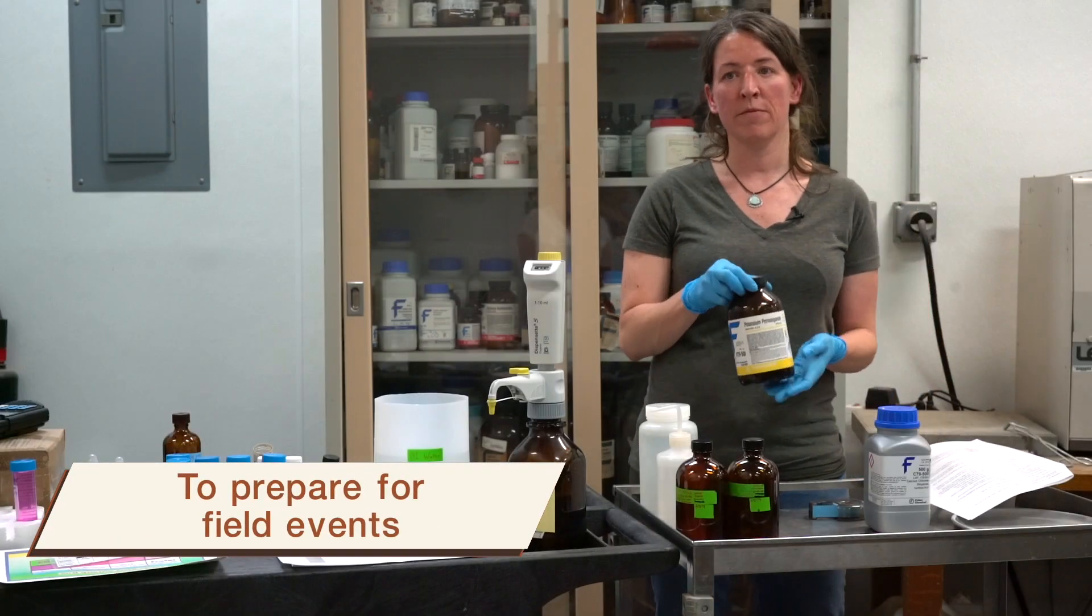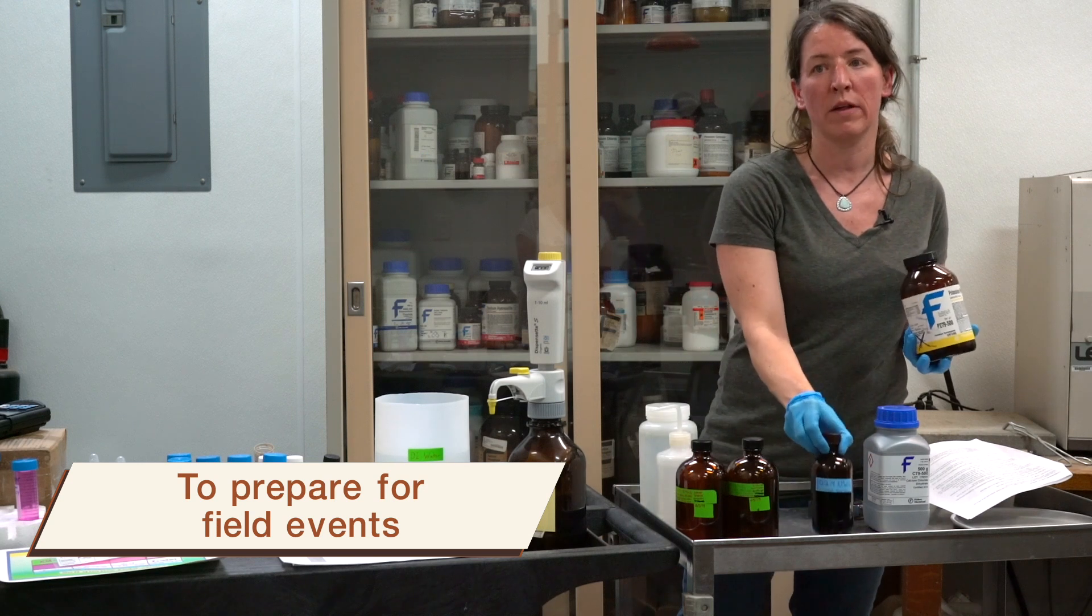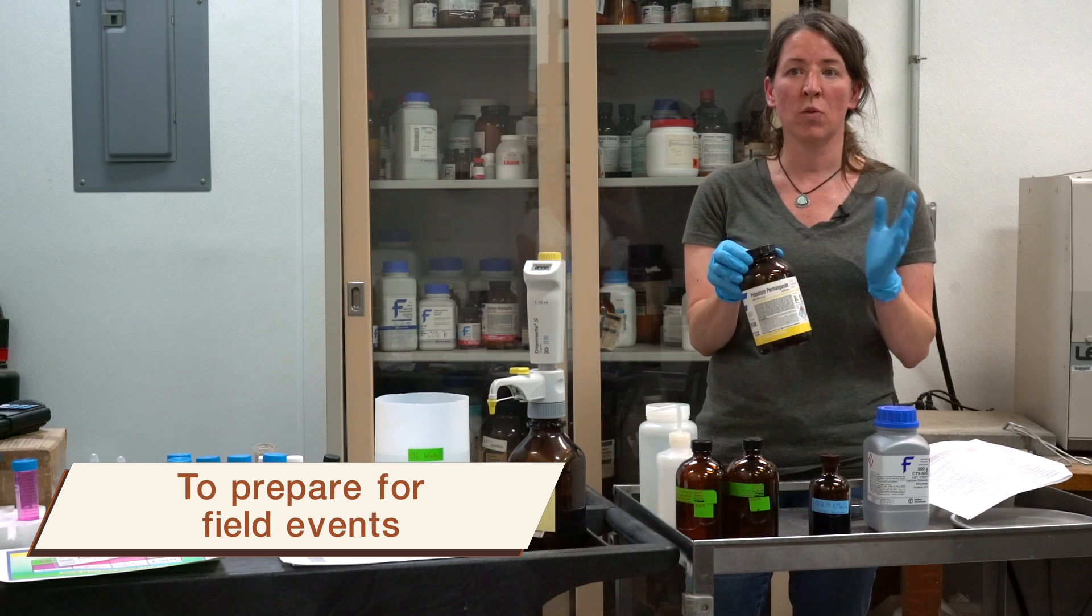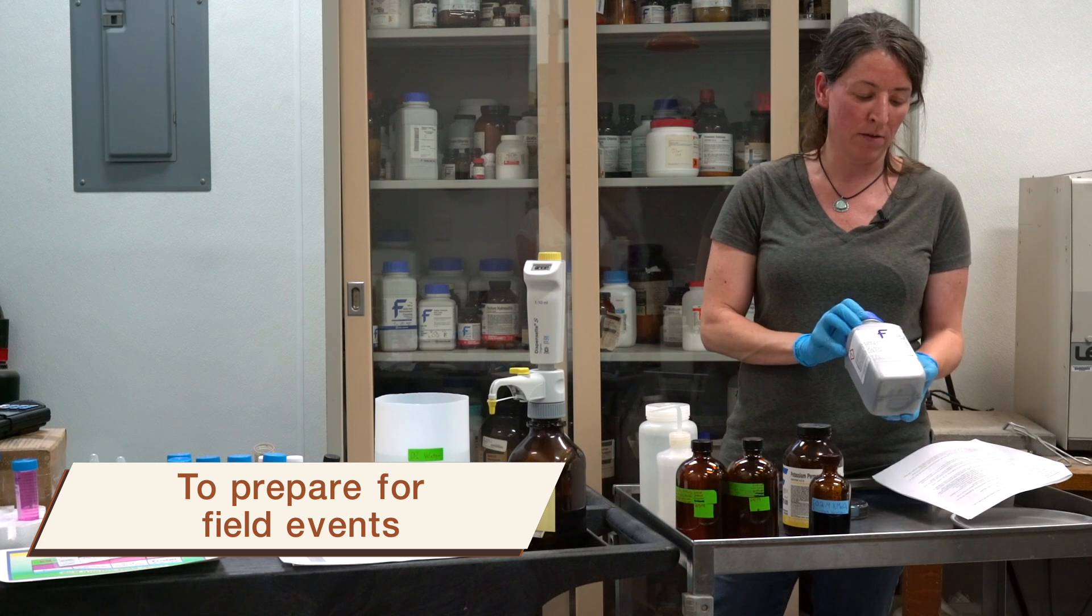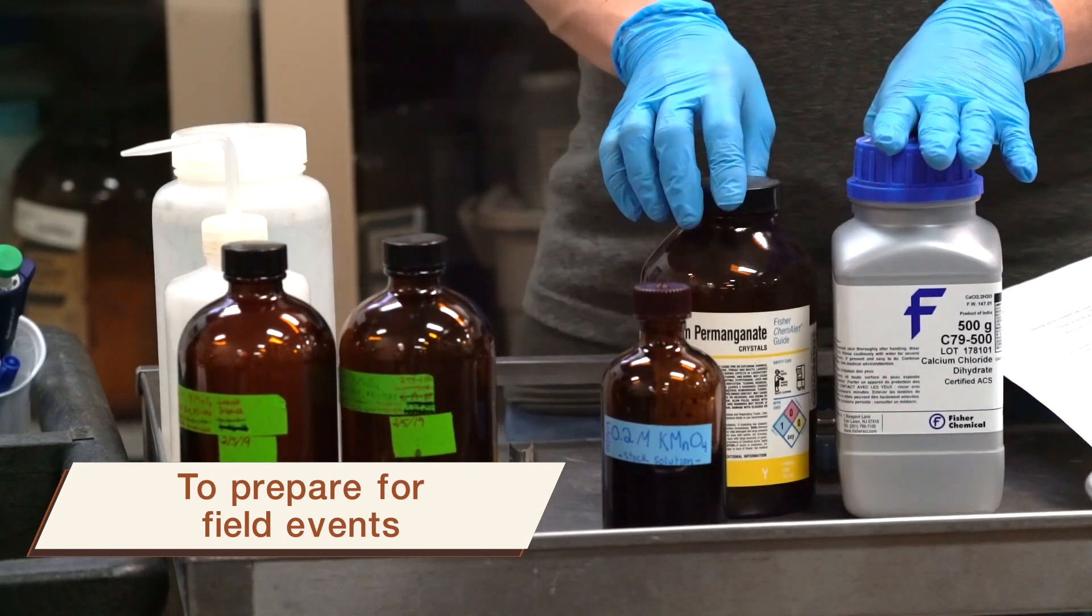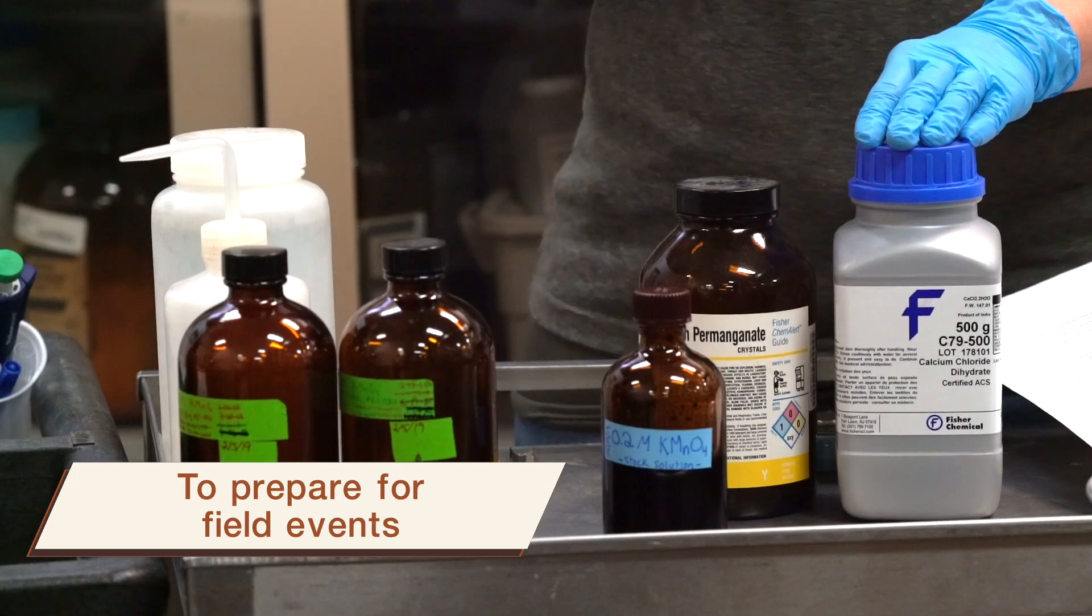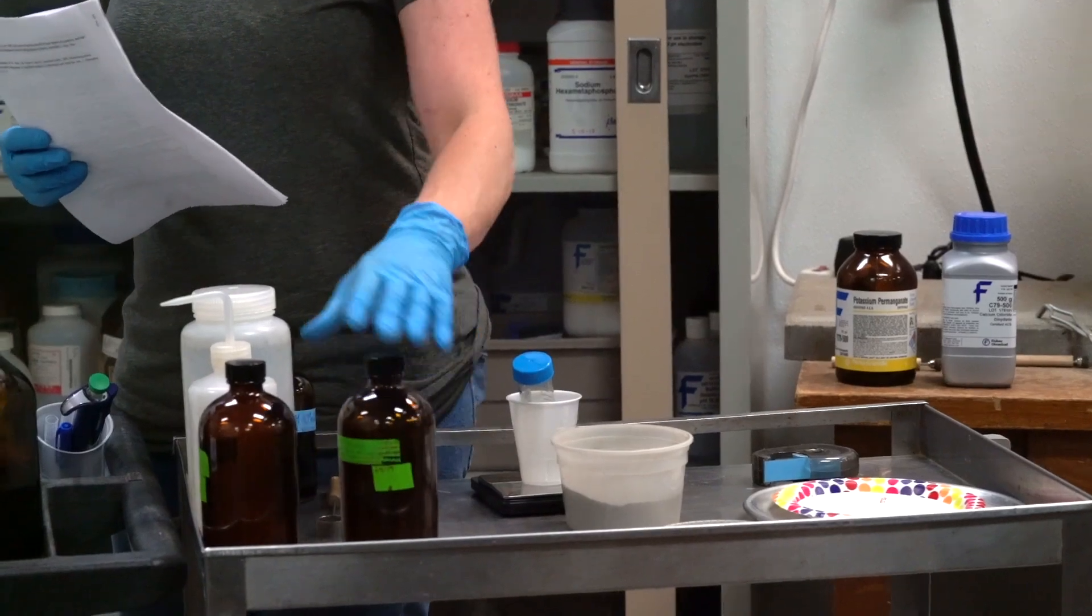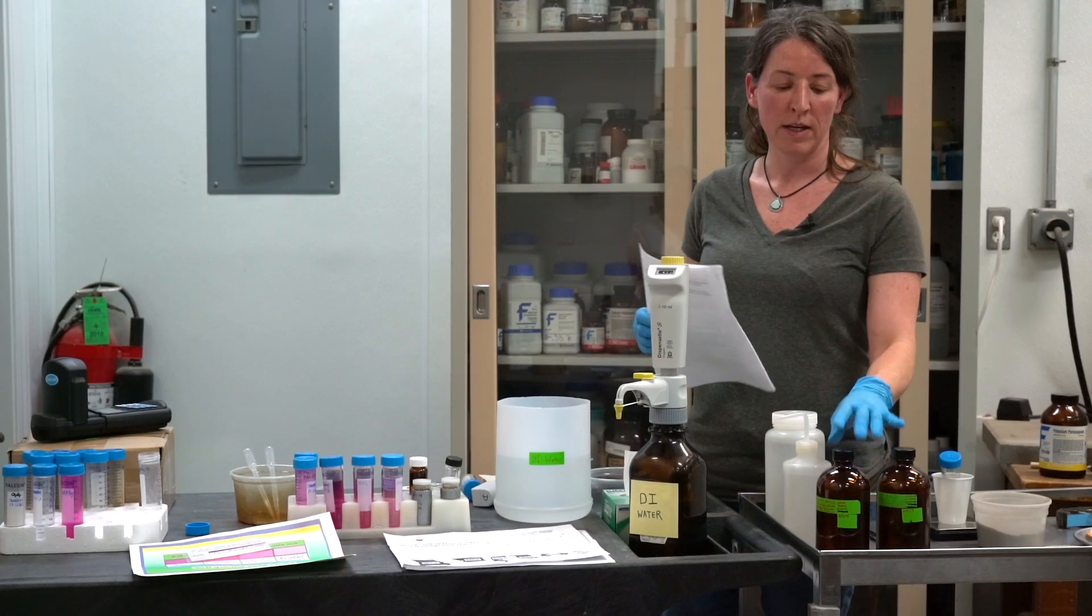To prepare ahead of time for the field event, a day or two before, you're going to want to mix up your 0.2 molar potassium permanganate, we call it the stock solution. You add it in powder form, weigh it out into one liter of deionized water. You're also going to add a specific amount of calcium chloride to that solution. Once you mix up your stock solution, measure the pH, you need to bring it up to 7.2, so add sodium hydroxide drop-wise. The potassium permanganate is very sensitive to light, so store it in a dark colored amber bottle and keep it cool in the refrigerator.